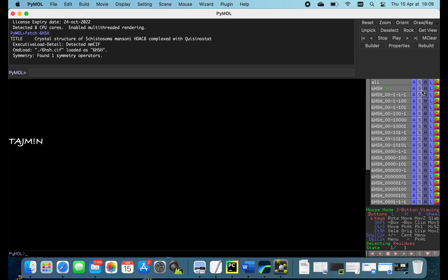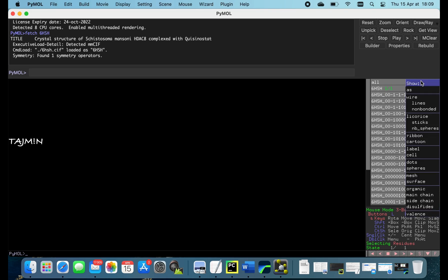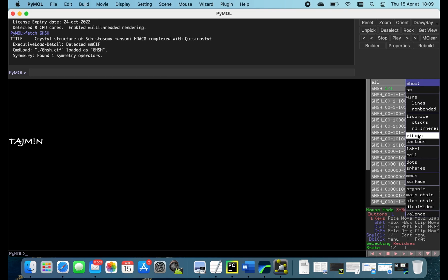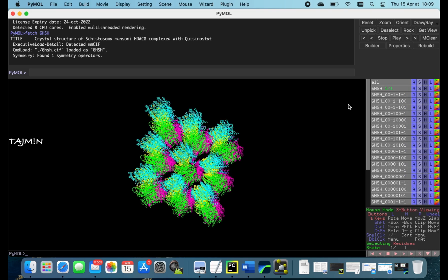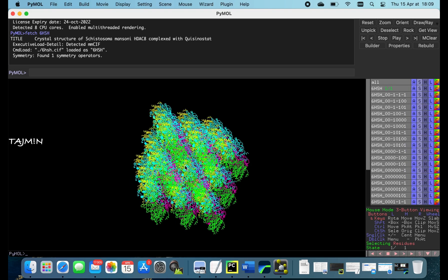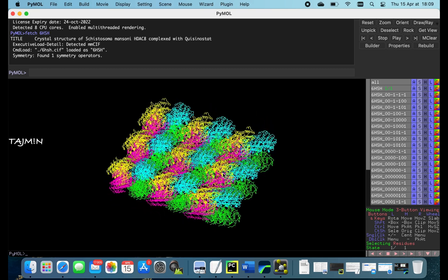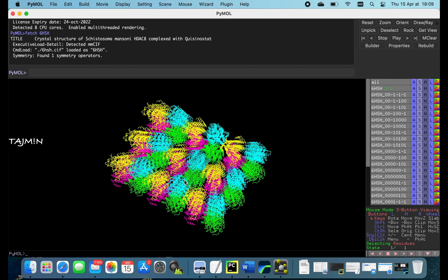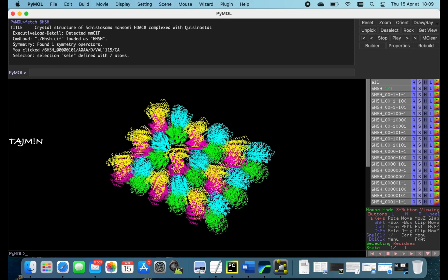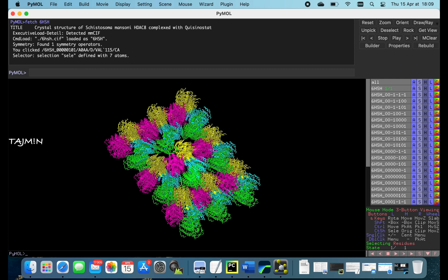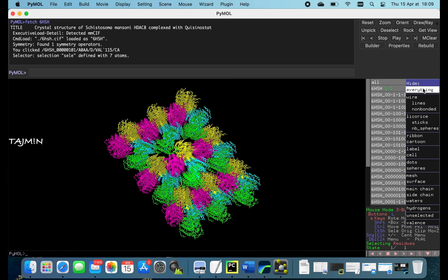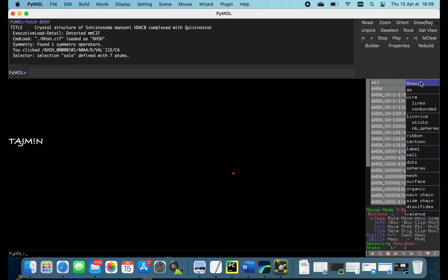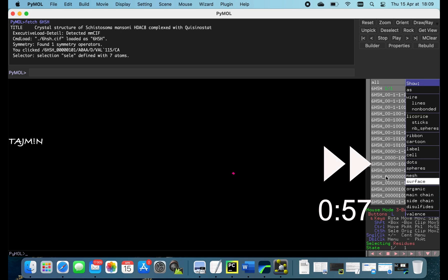Let's hide the cartoon and show ribbons. This should also be smooth without any problem. So we go to the next step by generating surface. This will slow down a bit. So I will fast forward here.